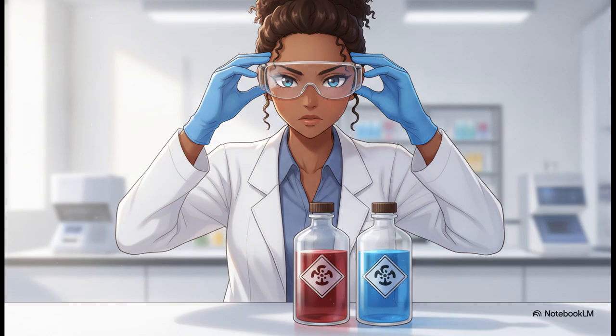And of course, before we touch a single beaker, we need to talk about safety. Strong acids like hydrochloric acid and strong bases like sodium hydroxide are highly corrosive and dangerous. You must always wear your laboratory coat, gloves, and safety goggles while handling these chemicals. Never, ever cut corners on safety protocols in the lab.